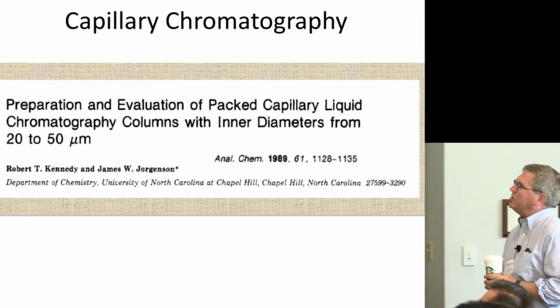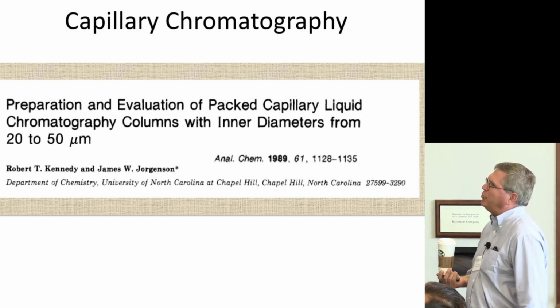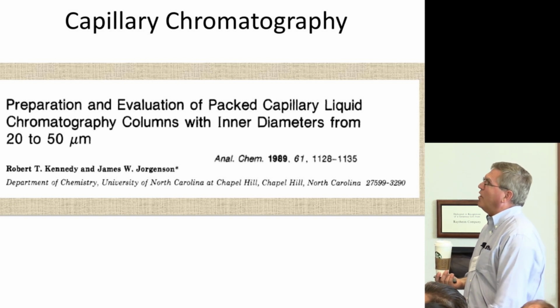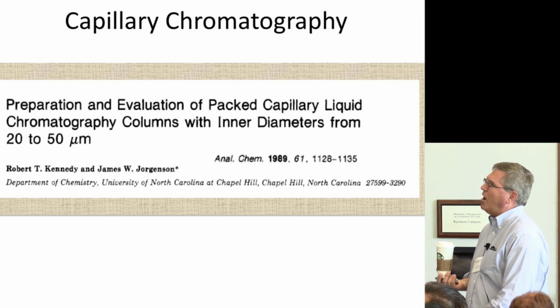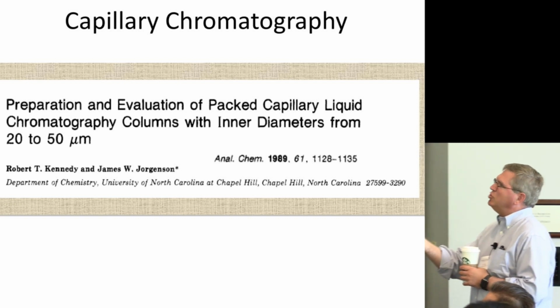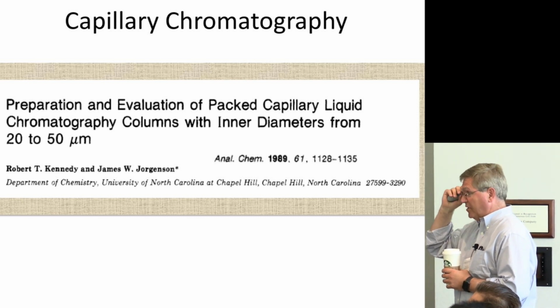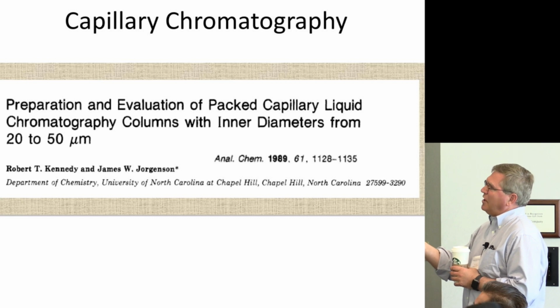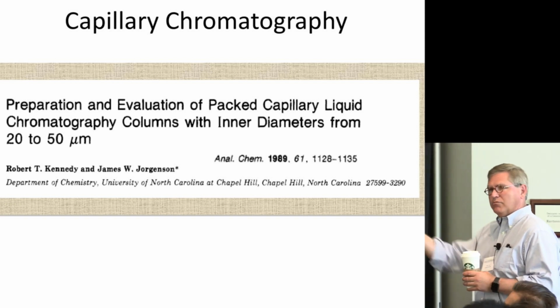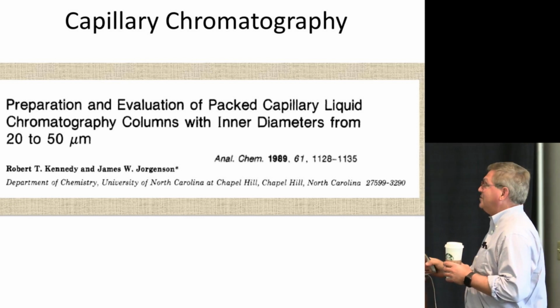The other thing that was important too, and these were developments that were going on almost in parallel to what was going on in the mass spec field, is the chromatography people were experimenting with nanoscale columns or microscale columns at nanoscale flow rates. And so this dovetailed really nicely into what we needed in mass spectrometry to scale down the flow and to improve detection limits. And I mean, Jorgenson certainly, they were trying to investigate wall effects in chromatography using these strategies rather than thinking, oh, those guys over there are doing mass spectrometry, they're going to need these small columns someday. So it just worked out beautifully.